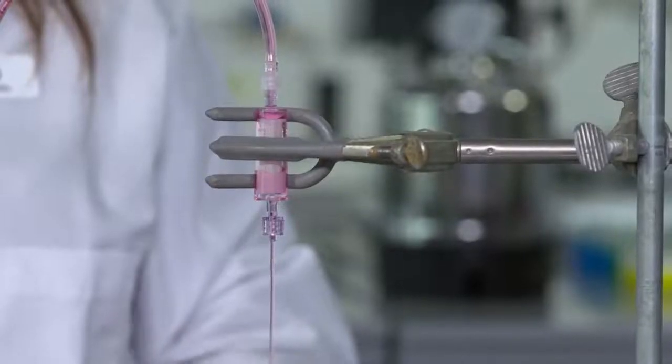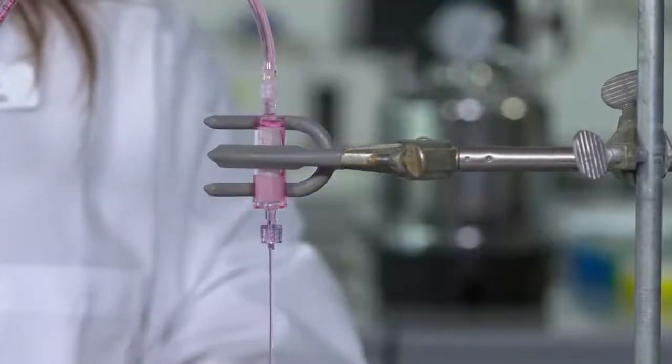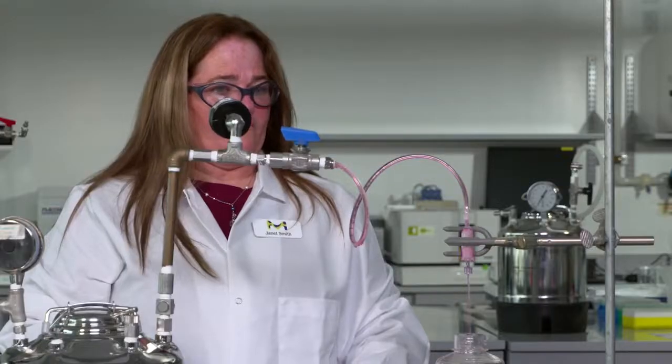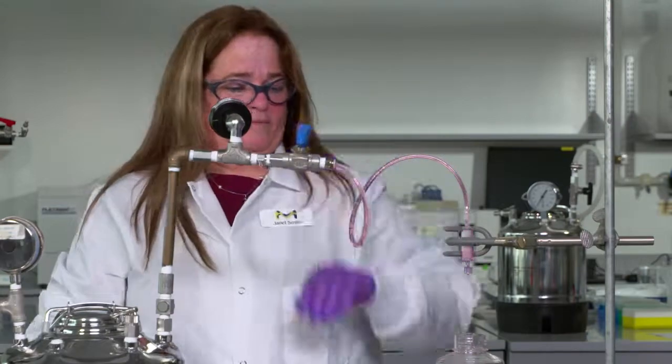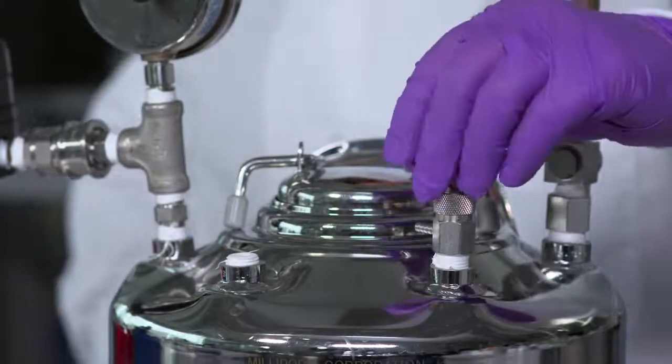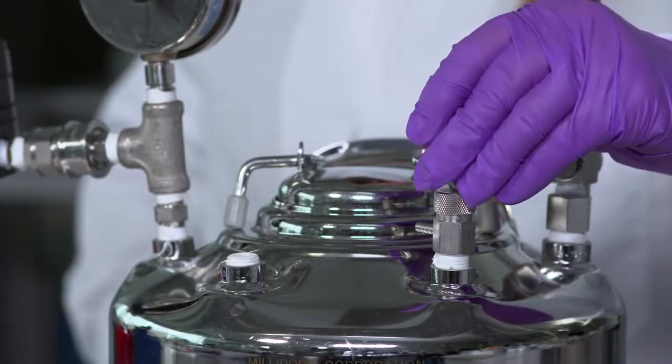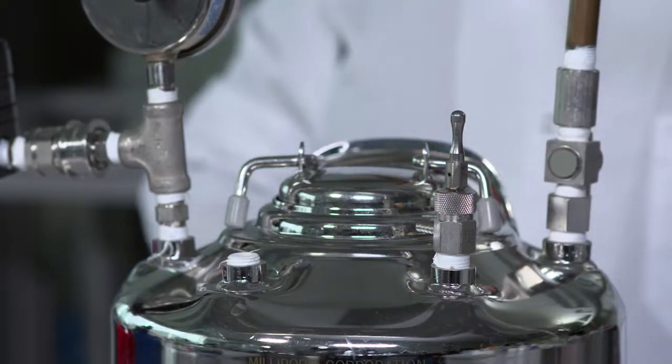If needed, tap device to dislodge any air bubbles within the housing of the device to allow to vent out. Turn outlet valve off when complete or pause flow. Turn off pressure source. Depressurize pressure vessel using the vent relief valve. Once completed, the Sterivex filter can be removed, discarded appropriately, and pressure vessel opened for cleaning.